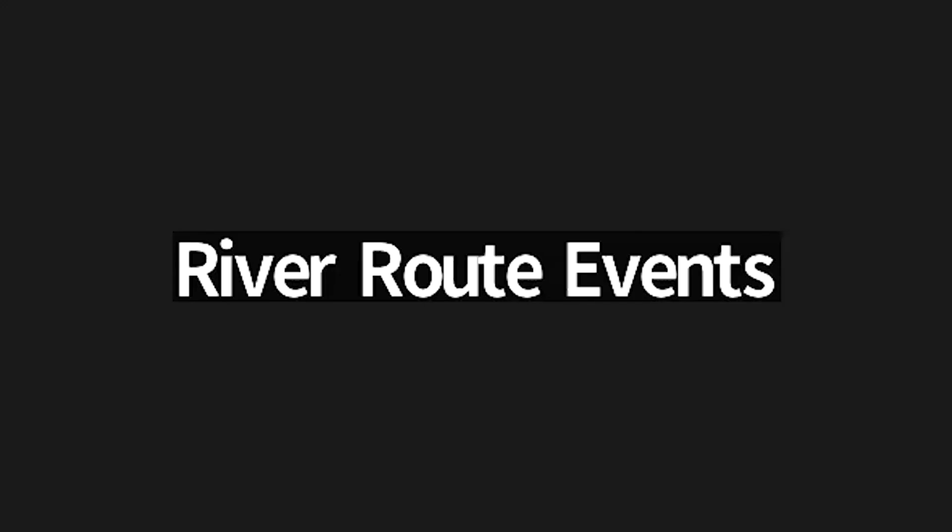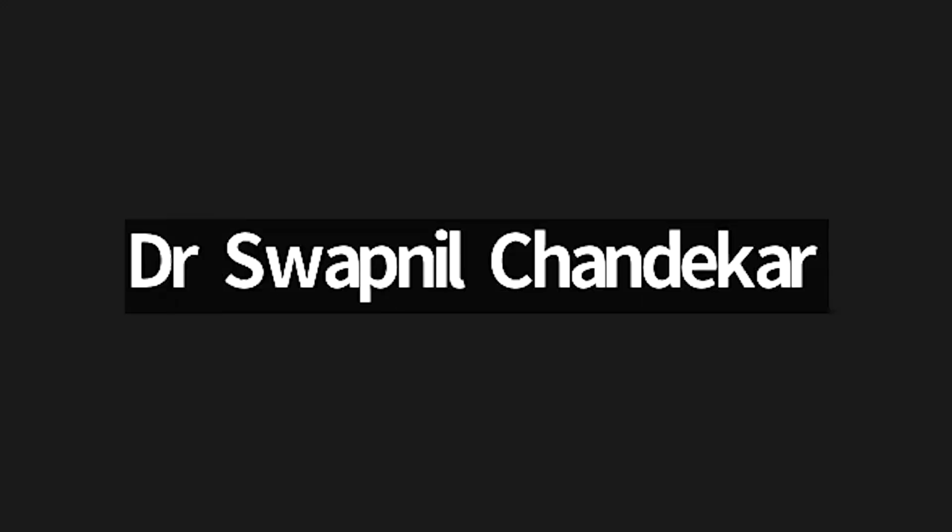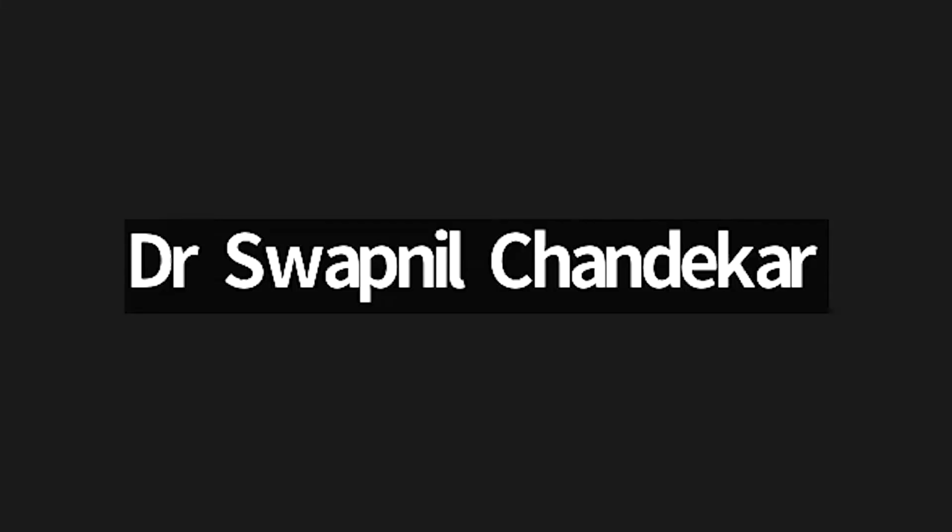Dr. Swapnil, please go ahead with your question. Myself, Dr. Swapnil Chandekar, sir. I am working in a research institute of ICMR in a remote part of Chandrapur district, Maharashtra. We have a facility for flow cytometry. Can you provide some guidelines so that we can work on AML or blood cancers at our institute? But are you getting clinical samples in your research lab?